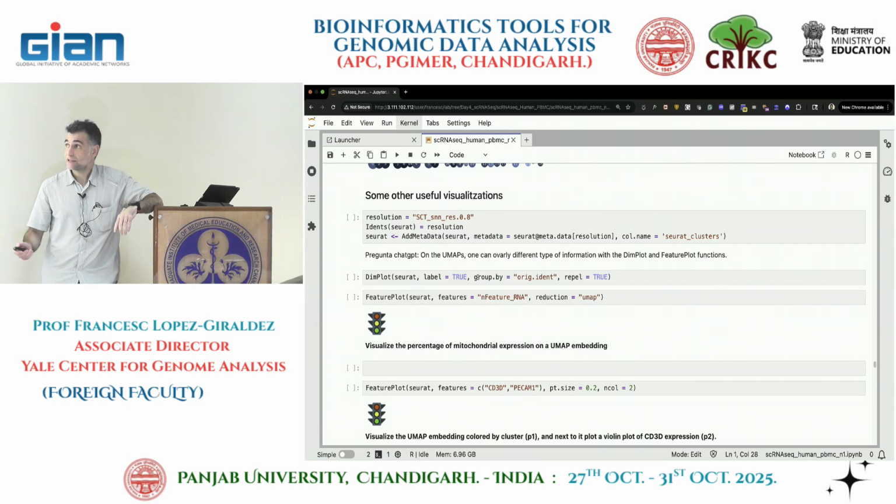So dividing cluster 0 into multiple subclusters doesn't mean there are subtypes. Again, that's what I'm trying to say. First, the clustering doesn't need to match your expectation of the biology. So that's the message that I'm trying to convey. It is based on the expression, right? So it is not artificially creating clusters. It's just based on the expression. But if what you care about is cell types, it doesn't mean that every cluster is a cell type. It doesn't mean that.